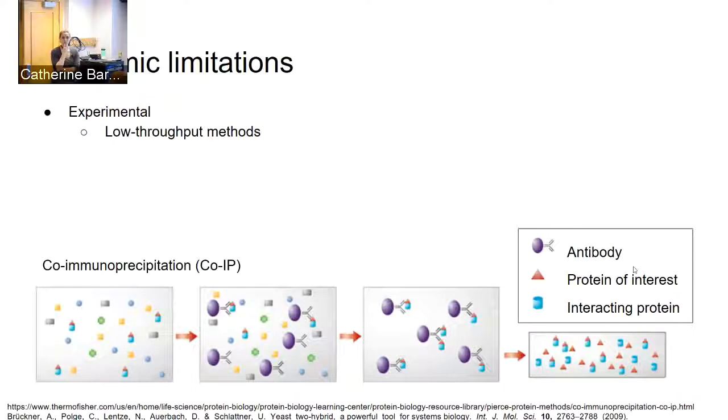But if a reviewer asks you what are the new protein interactions you can identify, then you need to have a benchmark result to show, given the cross-linking score, what is the probability that two proteins interact or not?